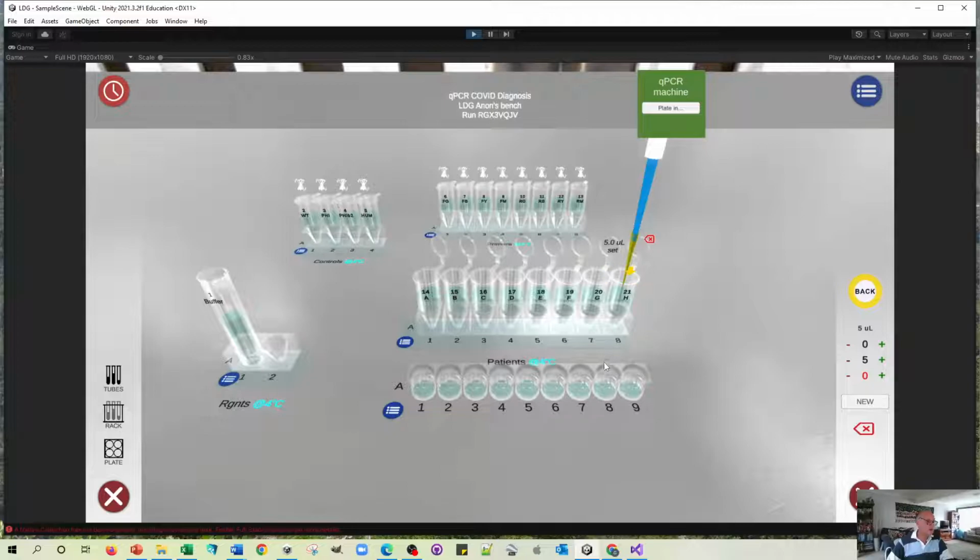And then the very final one, number 9, I could leave blank as a sort of control. I could put human cDNA in. I'm going to put wild type in there because I want to just check that these green primers do work with the wild type. But I could have made a couple of extra wells, one for human as a sort of negative control, one with nothing in as a real negative control, that sort of thing.